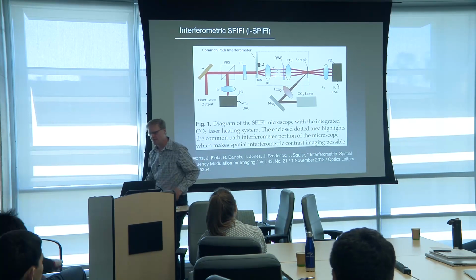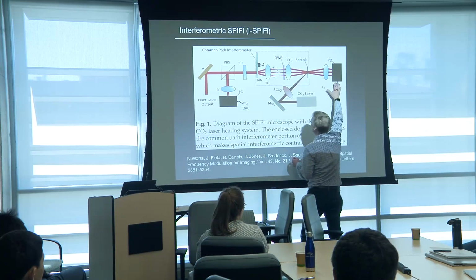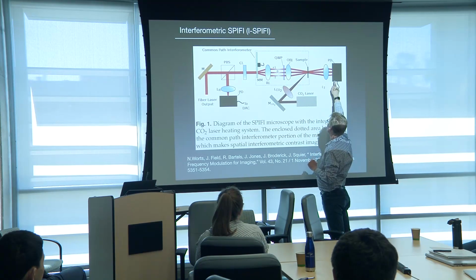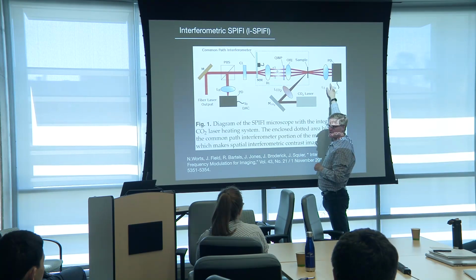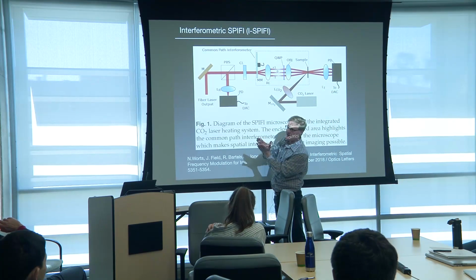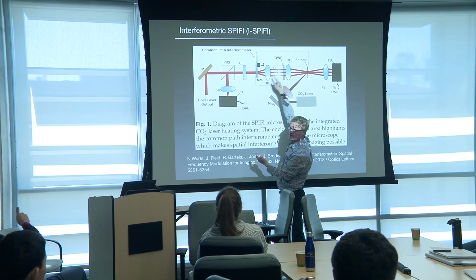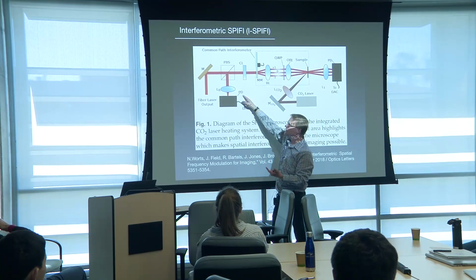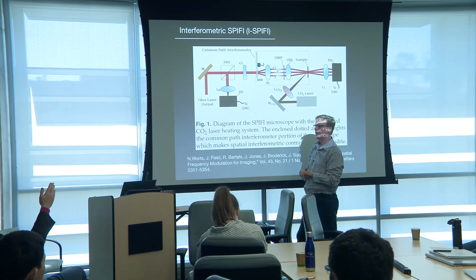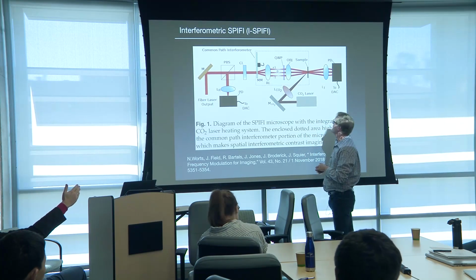Yeah, so let me explain. What I did is I imaged from this direction and this direction simultaneously. And this one doesn't show the fringes. Got it. Because you really are using this mask to put them right on top of one another. You're changing the phase change that you see here into an amplitude modulation that only shows up when we detect it back here. And let's say you have another phase modulation happening beyond the sample. You won't be able to see it, right?